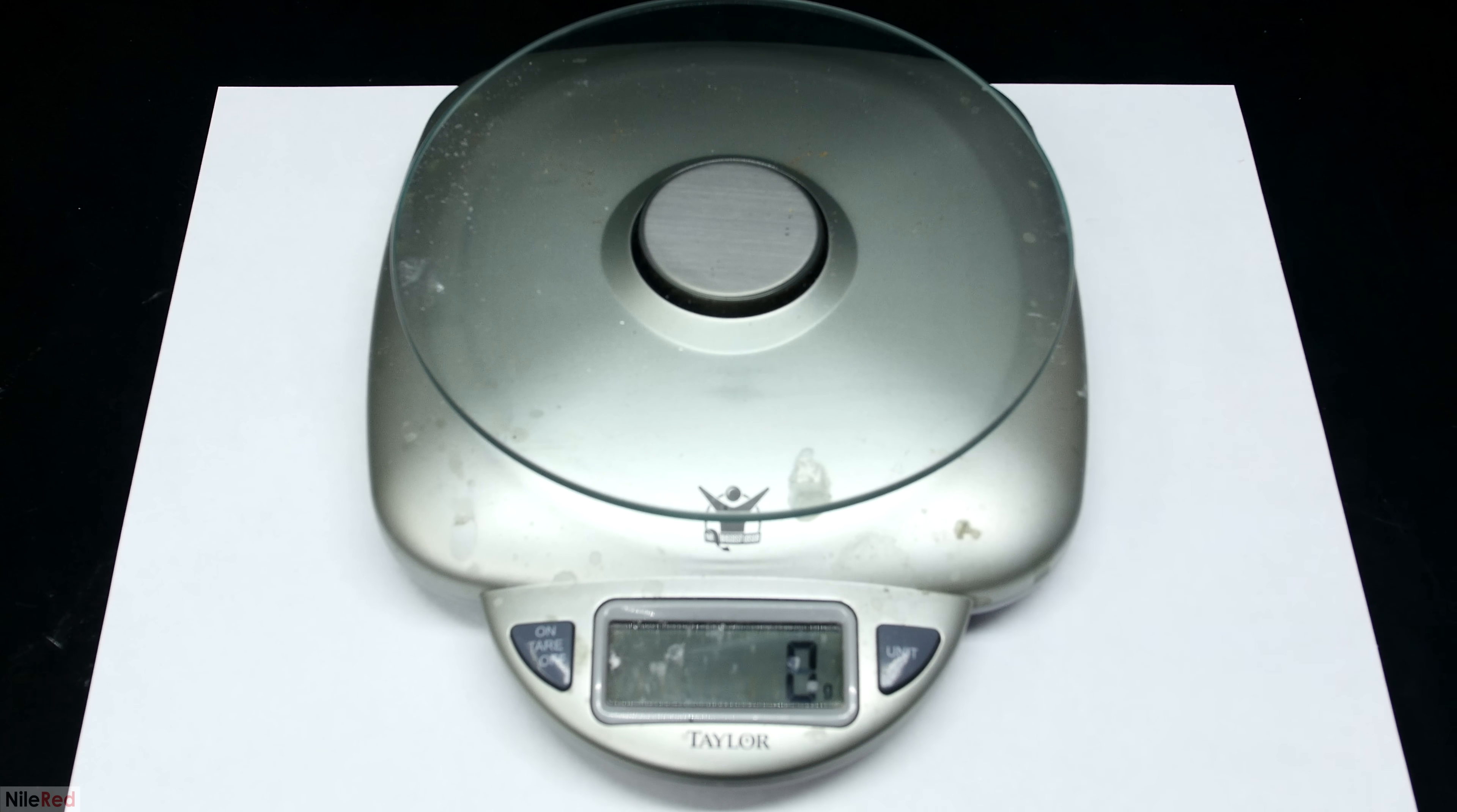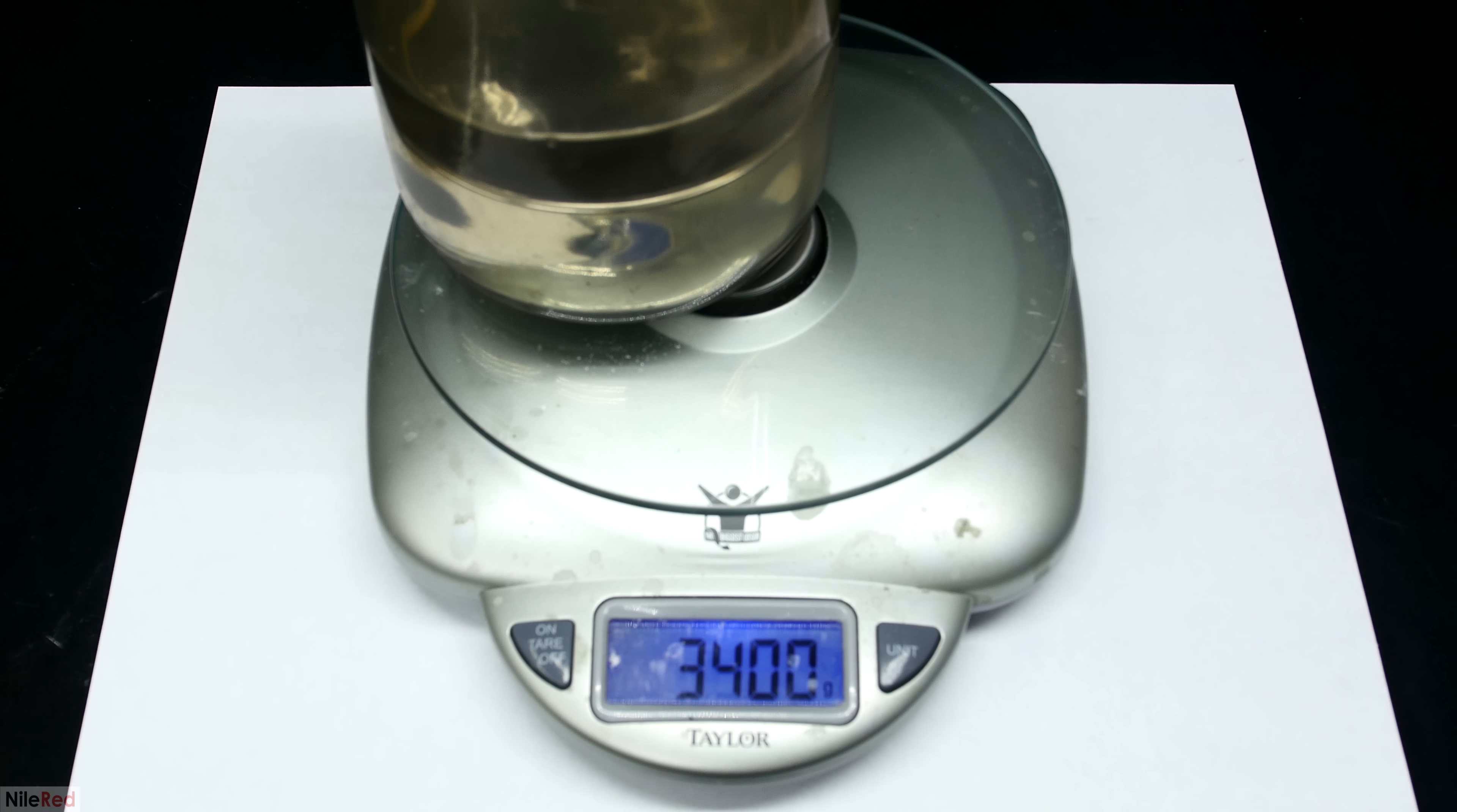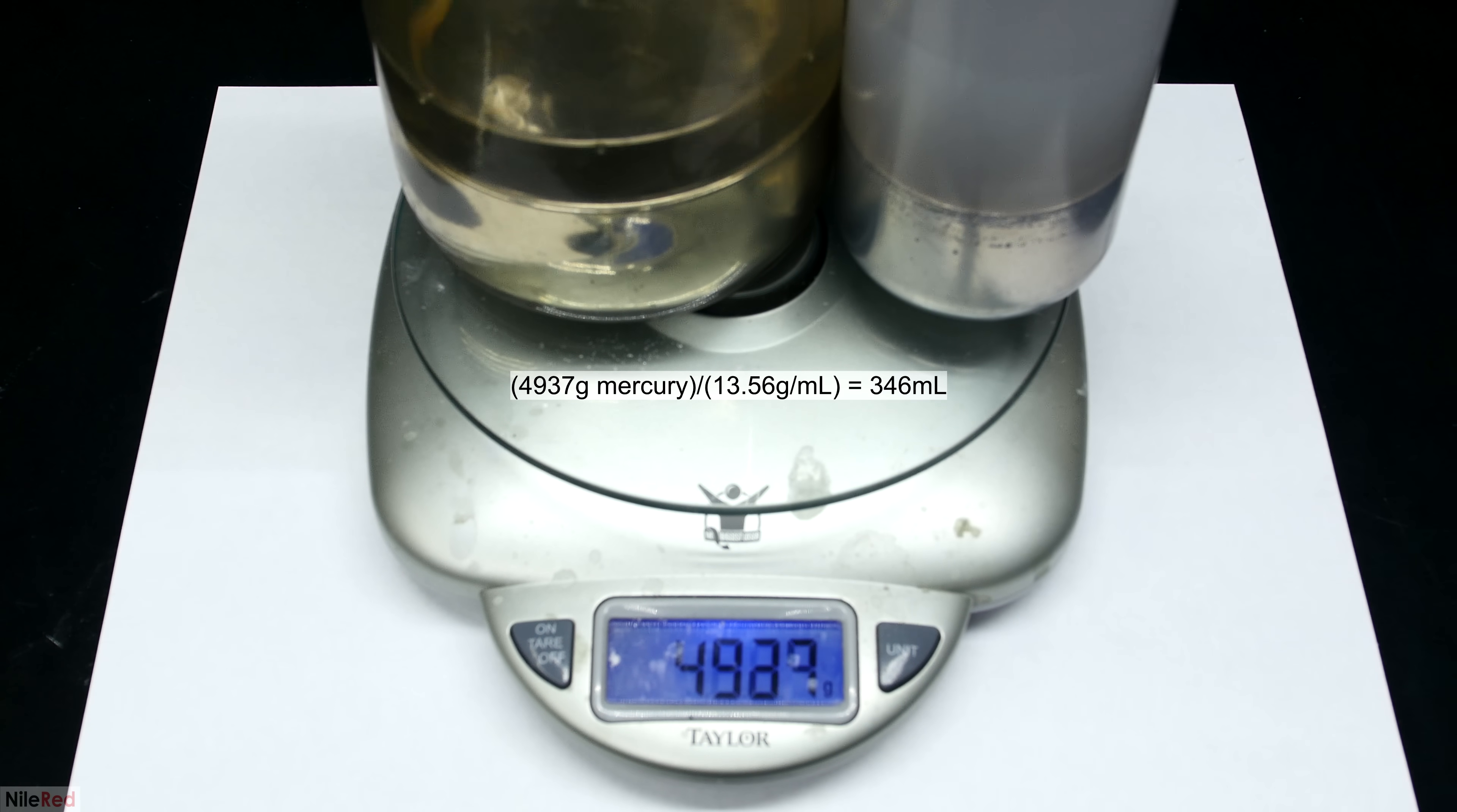Before we start, I'm gonna weigh out the mercury, and this is just to show you guys the mass that we're working with. The mass will be a little bit inflated because it will include the water and the bottle, but you should still be able to see that it's quite heavy. The first bottle alone weighs something like 3.4 kilos, and the second one weighs about 1.5. From this mass, we can approximate the volume of mercury that we have by dividing it by the density of mercury. This obviously won't be super accurate though, because I'm including the mass of the bottle and the water. What it tells me though is that I'm working with something around 350 milliliters of mercury, which helps me decide the size of the flask that I'll distill it in. I'll talk about flask choice a little bit more when we get to the actual distillation.